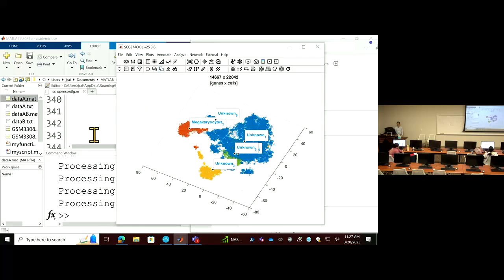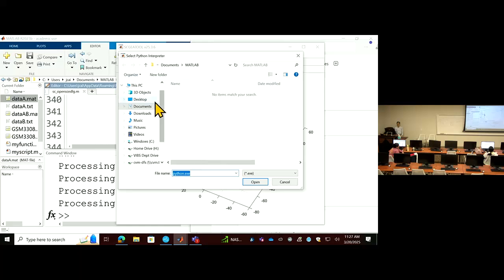You need to click yes to search for where Python is installed until you find it. But we haven't installed Python, so we don't have that. Once you find the python.exe file, then make a link, and these two languages can communicate after that.